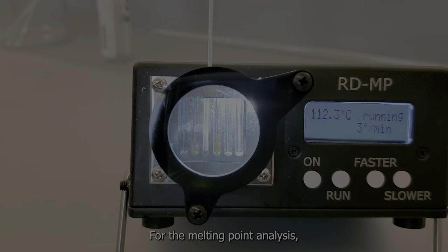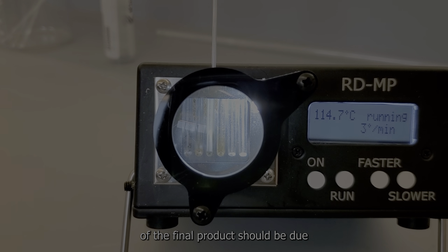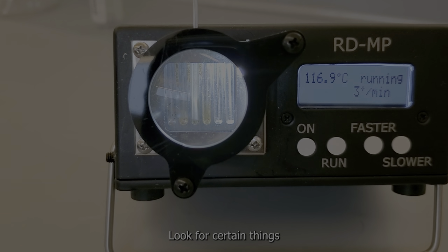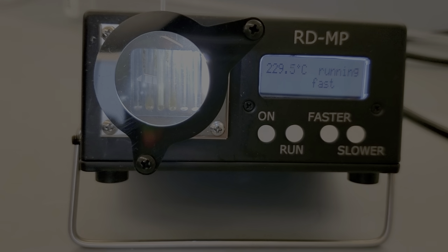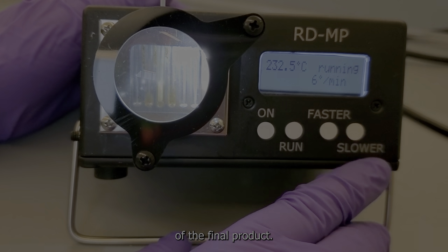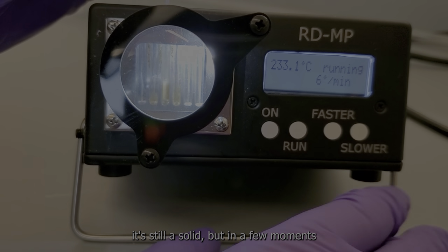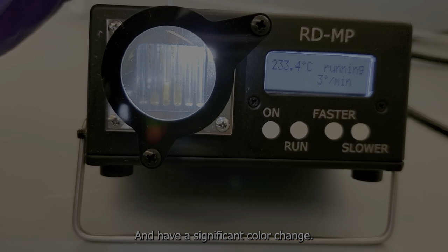Now for the melting point analysis. You should have an initial idea of what the melting point of the final product should be due to the physical properties table. So once again, I'm just bringing up why this table is important, because it will help you look for certain things during your experiment. And here you can just observe the melting and then record the actual melting point of the final product. You can clearly see it's still a solid, but in a few moments it will turn into a liquid and have a significant color change.